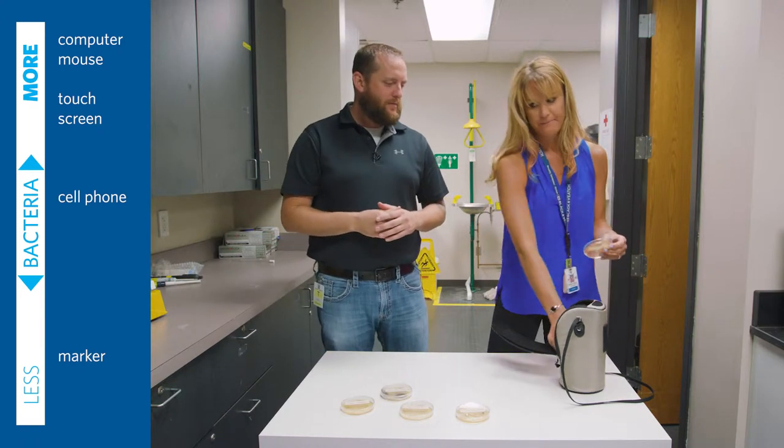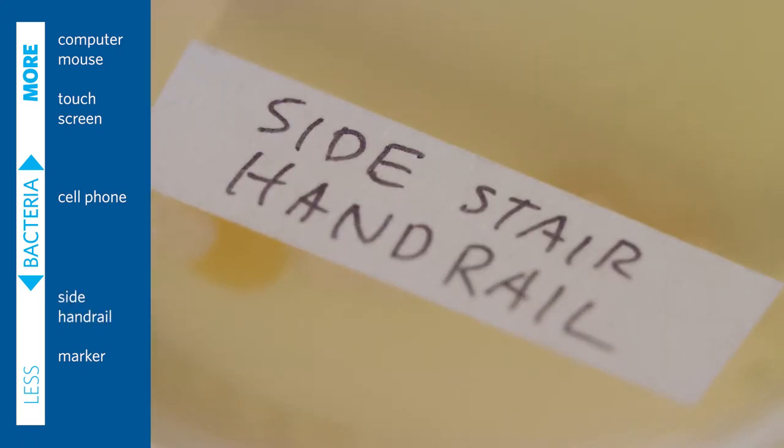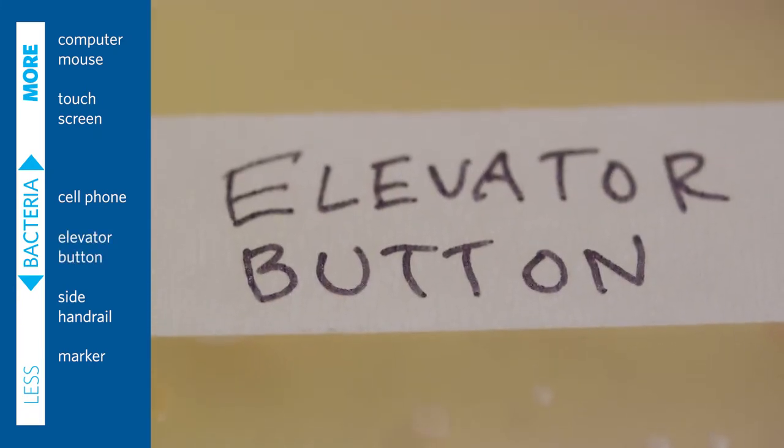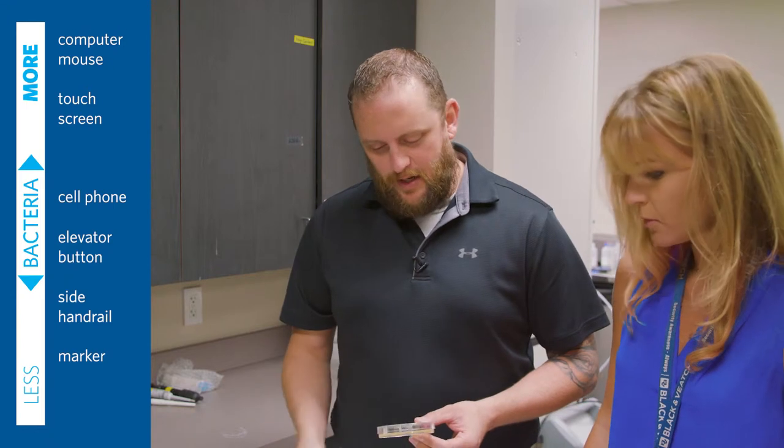The side handrail, surprisingly not too dirty. All right, the elevator button, surprisingly clean for how many times that gets touched. It looks pretty comparable to the side handrail. Yep.